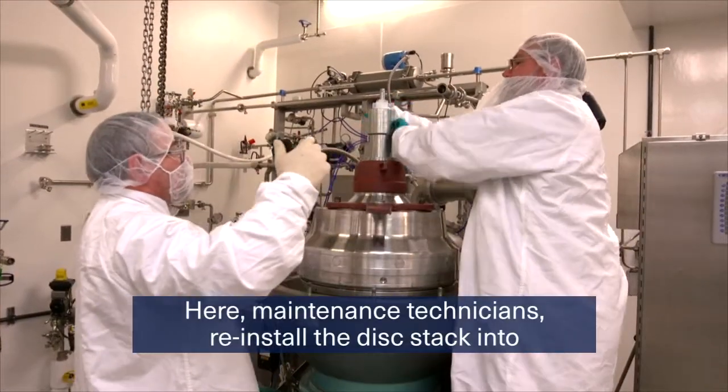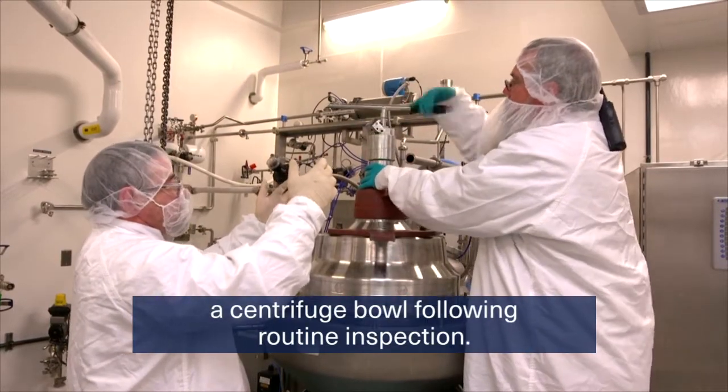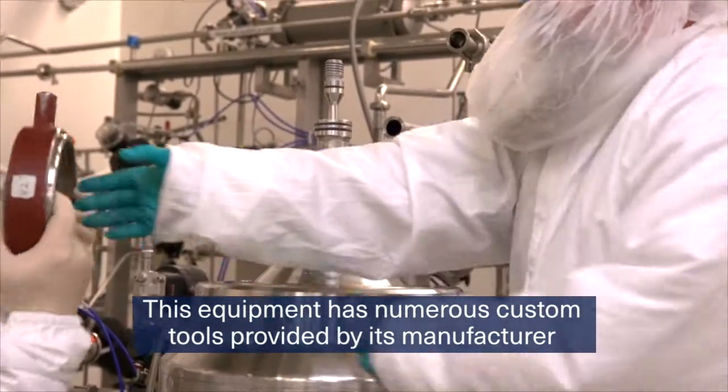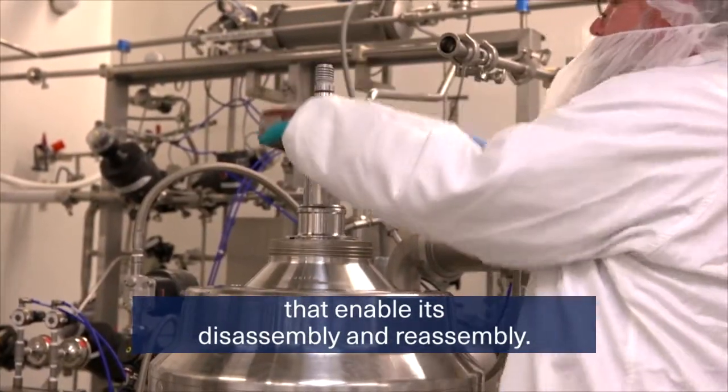Here, maintenance technicians reinstall the disk stack into a centrifuge bowl following routine inspection. This equipment has numerous custom tools provided by its manufacturer that enable its disassembly and reassembly.